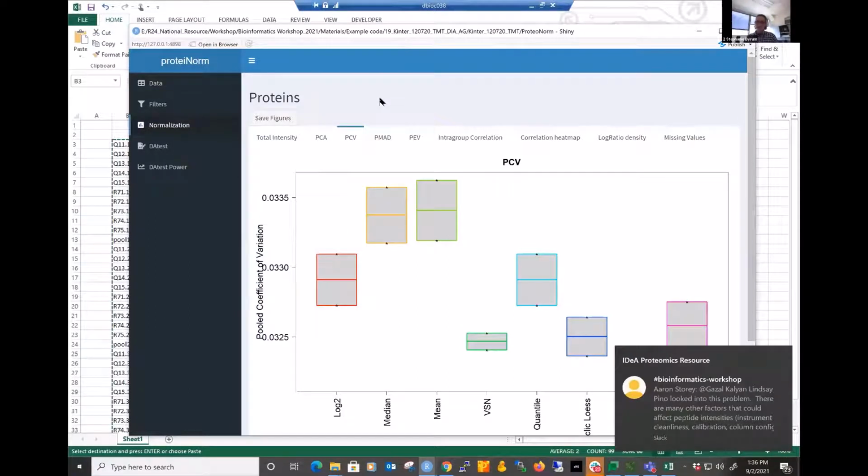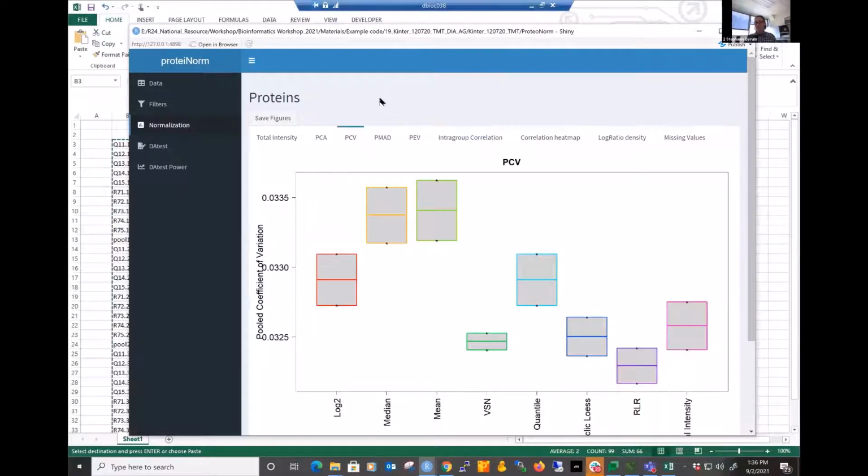And I don't know that I have the best answer for all of the normalization stuff. So I'm going to walk through what we do with this tool, and then I'm really hoping we can have that open discussion this afternoon. Those are exactly some things that I want to talk through. So I think I'm going to answer your question in a little bit, if that's okay. That's right. Aaron also put a reference in the channel, so we got some information. Good deal. There's a lot of things to look at and consider when you're doing those types of approaches.